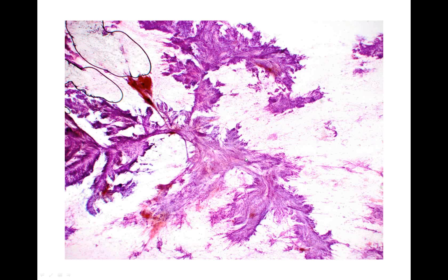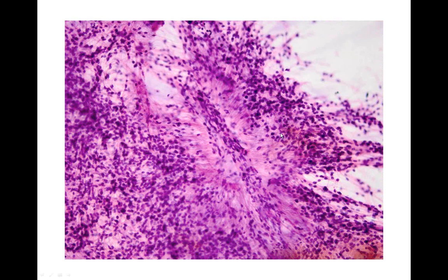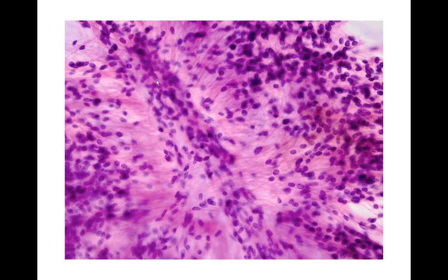Now, on the smear preparation I did, you can see it's got this very, to my eye, kind of pretty architecture. It's really splayed out quite nicely. And as we go to higher magnification, we actually get a little sense of the architecture of the tissue. In particular, what we're seeing here is a blood vessel that's surrounded on both sides with tumor cells, and these thin pink processes extending from the tumor cells to the blood vessels.